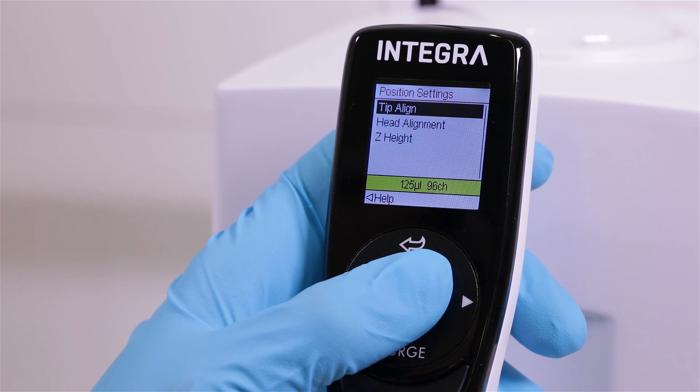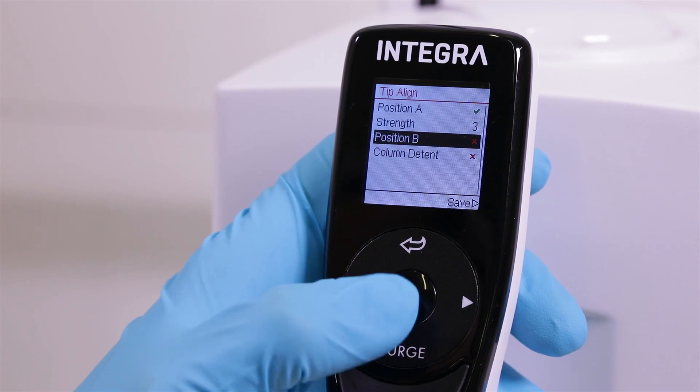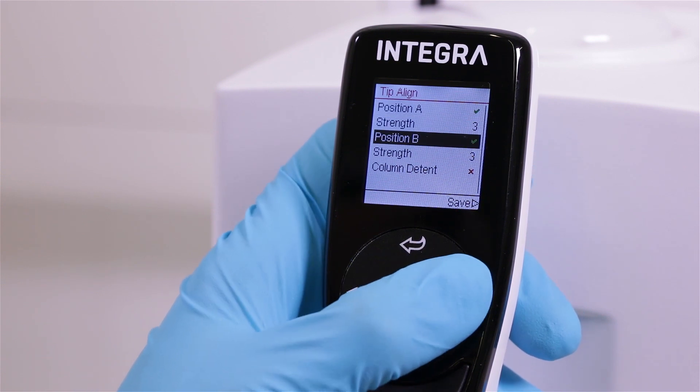Positioning aids can be activated when needed. These help to precisely align tips within the wells, or to stop tips at a desired height.